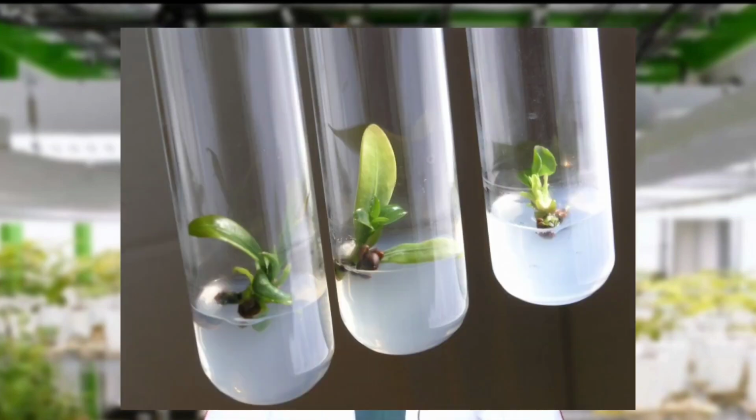Sterilization is known as the statistically complete removal of germs, including the most resistant bacteria and spores, while plant tissue culture is a culture that produces plant clones, known as micropropagation of in vitro cells, tissues, organs, or plants under sterile conditions.